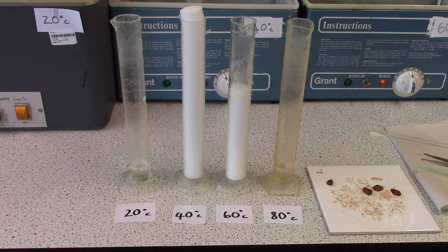If we return to the experiment after five minutes, we can see that the measuring cylinder that has hydrogen peroxide at 40 degrees is still producing oxygen gas. Therefore, we have an overflowing measuring cylinder with froth.